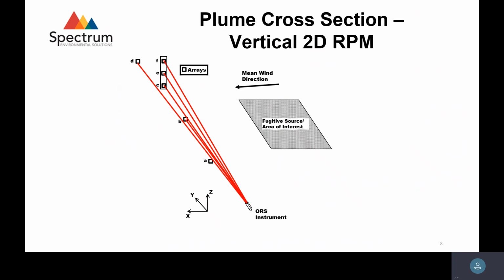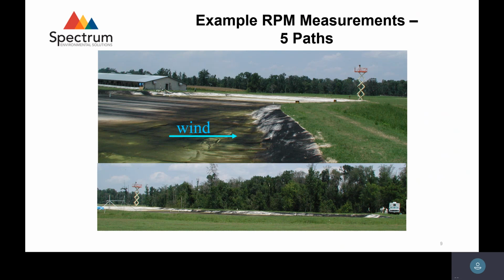Here's the application doing it vertically. So this is using a crosswind, and you could have an area fugitive source upwind. The wind blows through it. You basically create this cool little triangular approach, and you calculate the flux going through that zone. This is a bivariate Gaussian calculation, just Gaussian dispersion technique on the bottom, between the bottom row, and then the same thing vertically. You overlap the 2 bivariate Gaussian equations together, and can come up with a pretty cool estimate of the wind flow and the mass flow.